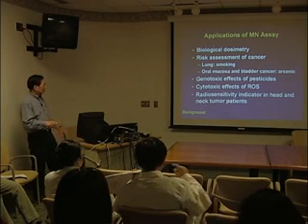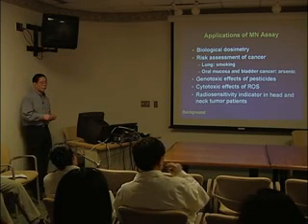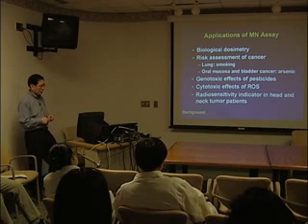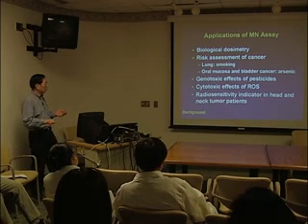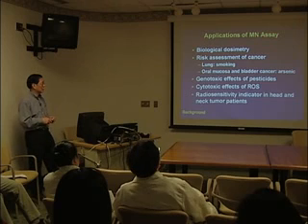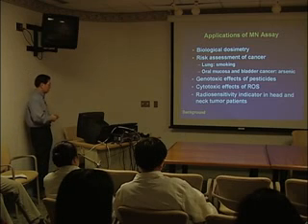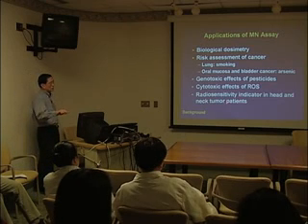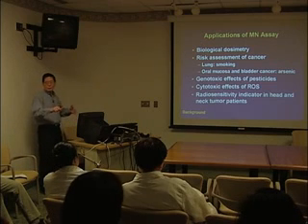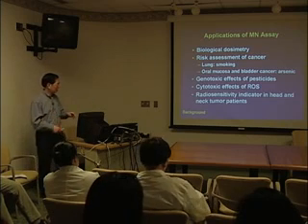And finally, for radiation therapy, because there are individual variations among patients in terms of their response to therapy, this could be another way of measuring their individual sensitivity by taking a blood sample and looking at the micronuclei. It was found that there's some correlation between the inherited radiation sensitivity and their response to the therapy. This is an ongoing study, so I really couldn't say that this is a method you can apply routinely for all patients yet.